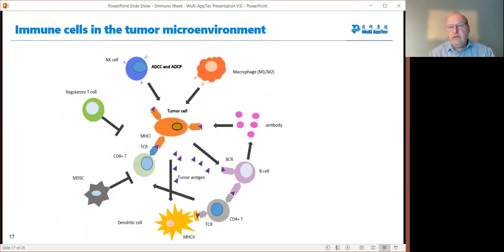I'd like now to turn to in vitro efficacy studies that can be carried out on the various cell types that contribute to the tumor microenvironment. In particular, I'll briefly present some assays we support in T cells, macrophages, and NK cells. And I'll go on to show some data for one of the frequently studied targets in this area.